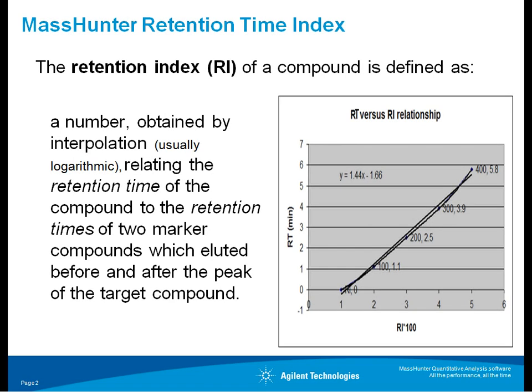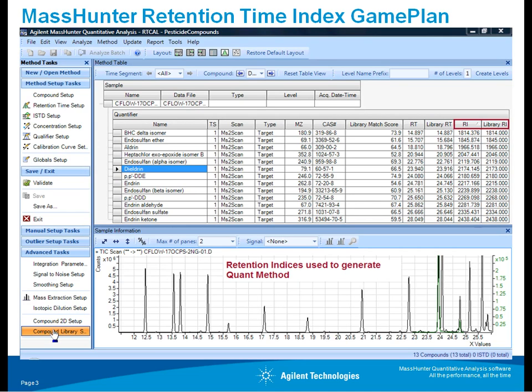Now that we have been able to create that retention index to retention time mapping, let's go back to the original goal. There's a number of ways to use this scenario. Unknowns analysis, which I think you can envision as very powerful with retention indices in the flavors and fragrances business, for example. When you're doing library searching with perceived compounds, you can use the retention index to help you constrain that library search and get a better, higher quality fit.